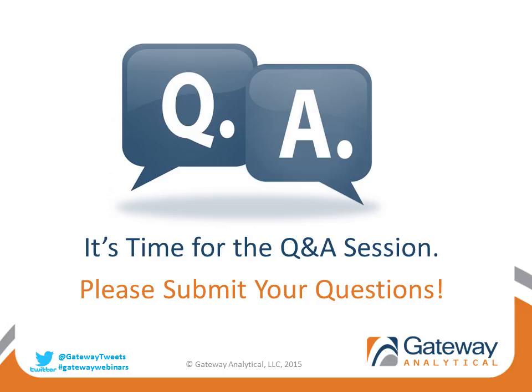Okay, great. So to our next question. You mentioned Raman spectroscopy is complementary to FTIR. Do you mean to say that Raman is more typically used after FTIR? So this is Julia. Typically, as an analyst, that's usually the route that I take. I'll first perform FTIR on a particle or on a fiber, and depending on the results that I get from that and from the SEM, then I'll move on to Raman. But that's not the case all of the time.